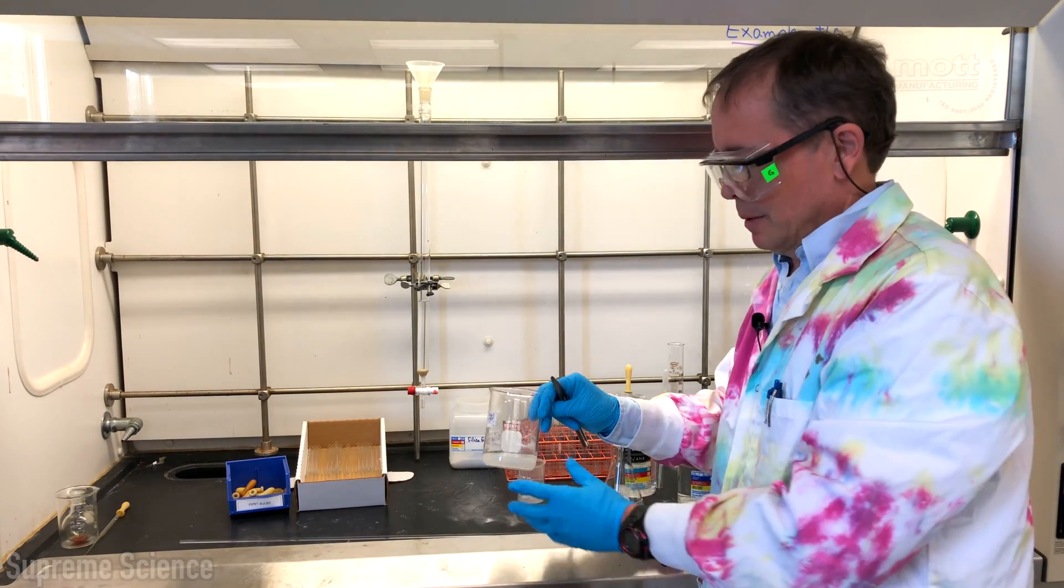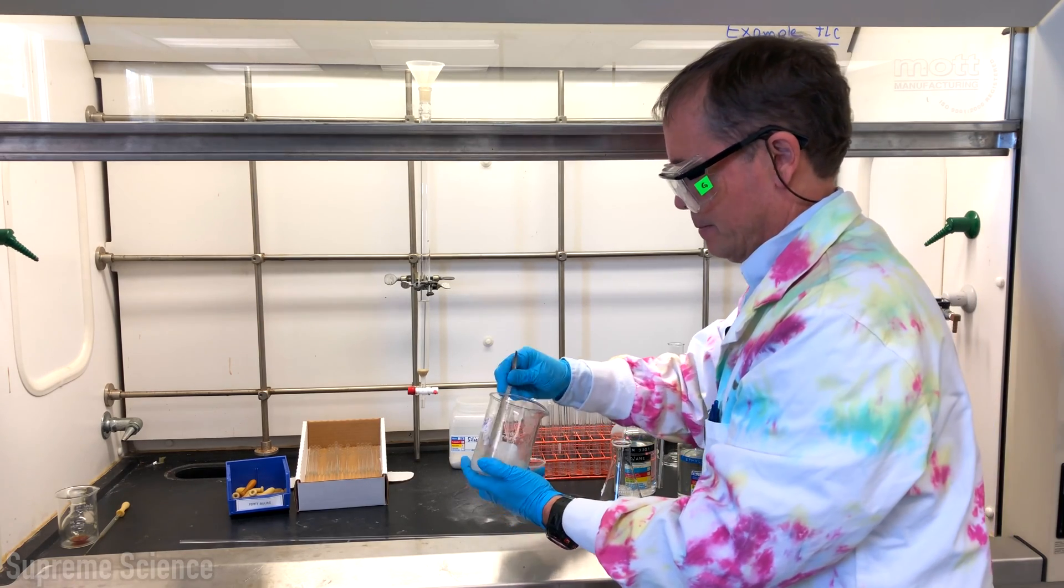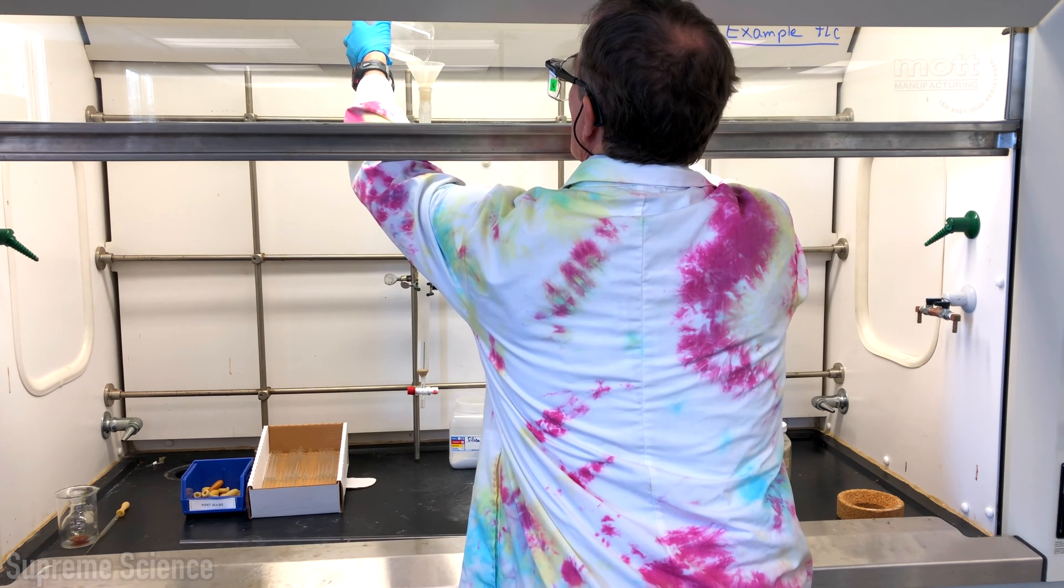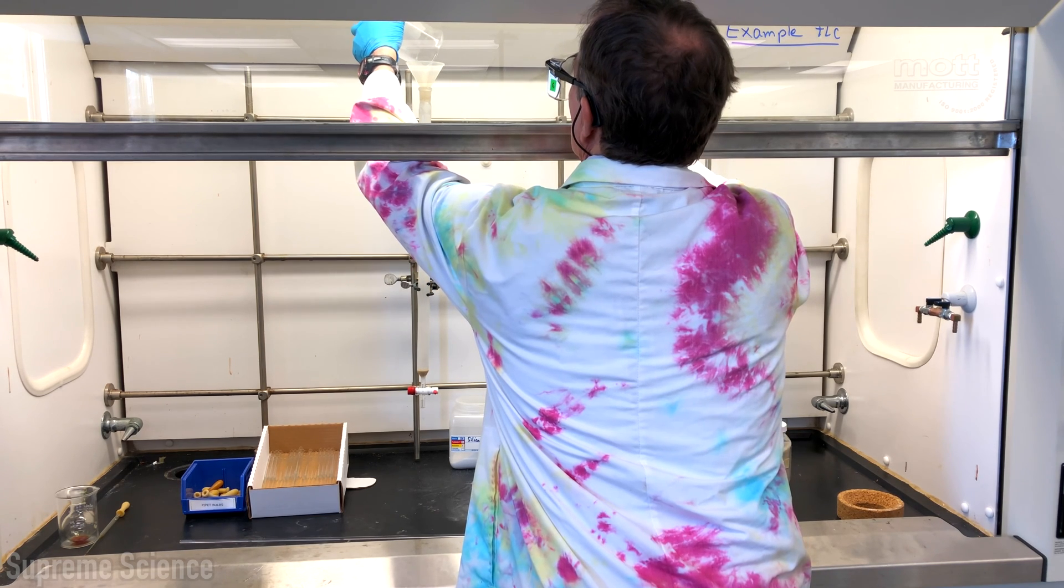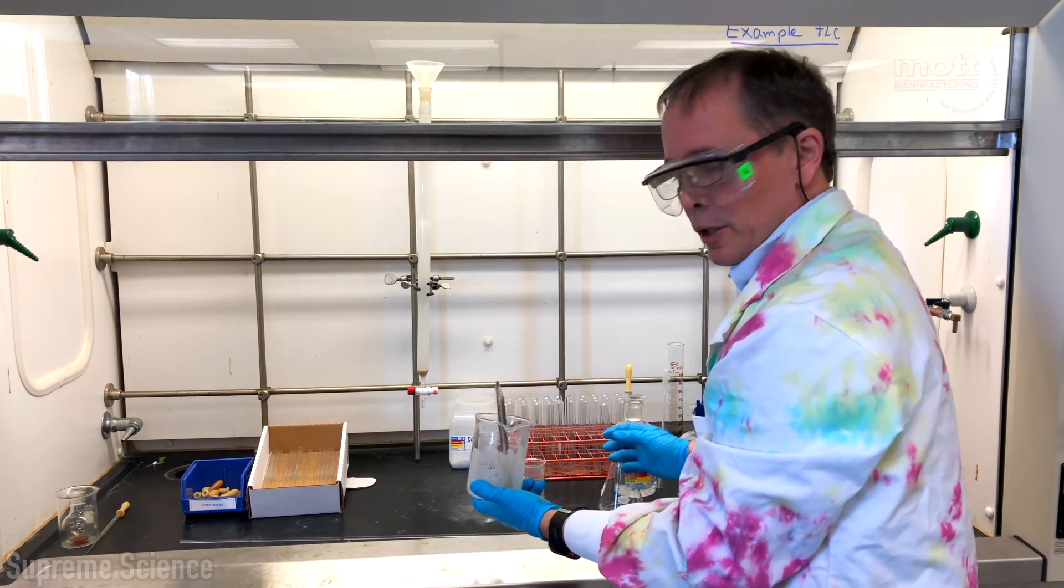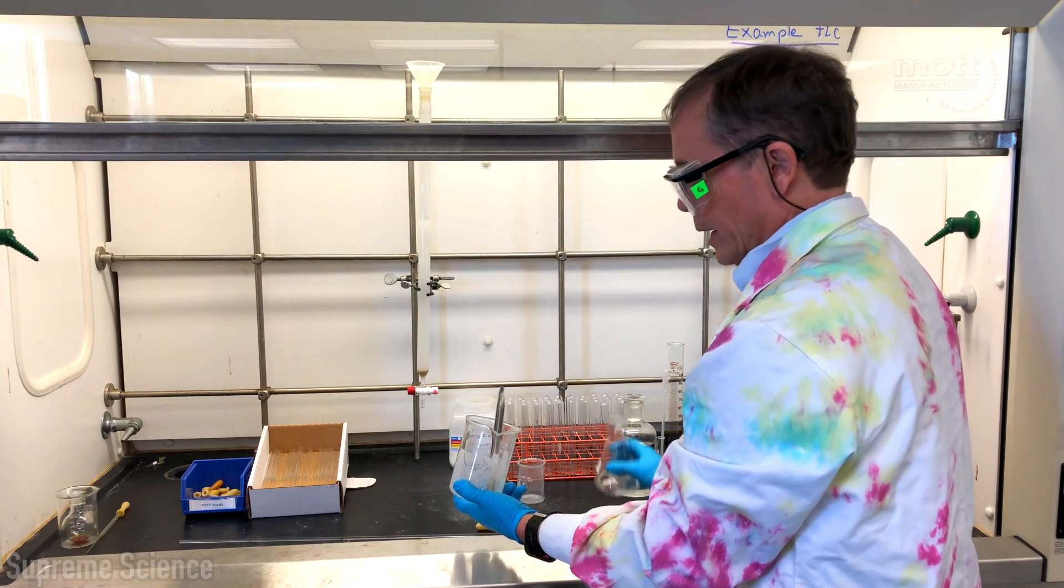Using a plastic funnel we pour the slurry into the column. Wash excess silica gel into the column using a bit more of our two to one eluent.